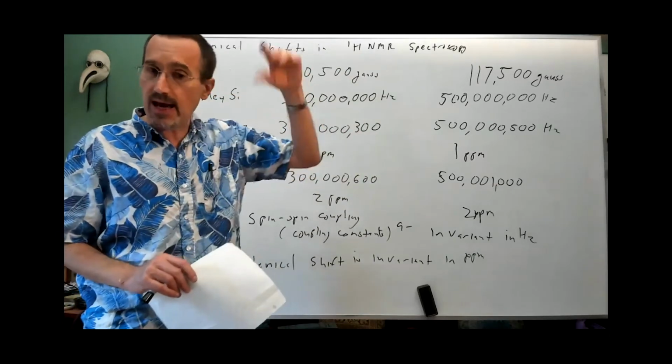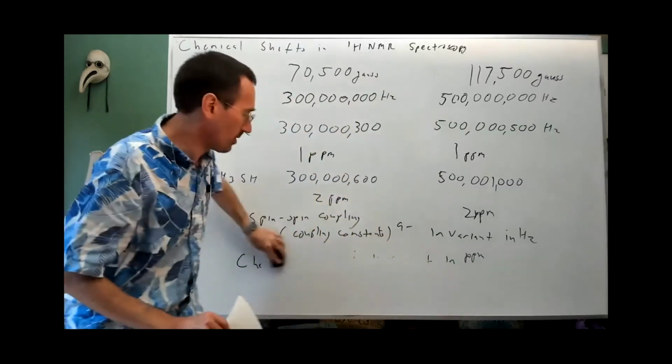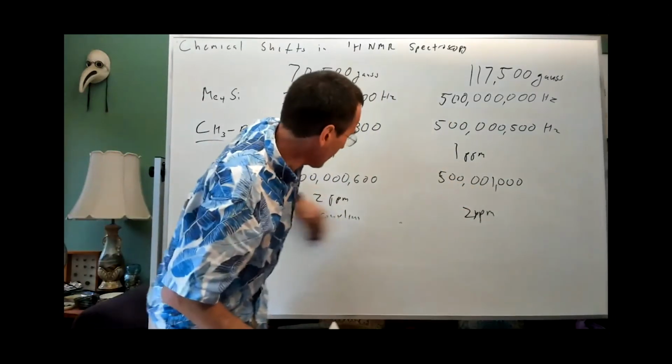It must be an ethyl ester group. This is essential that you're internally calibrated in this.